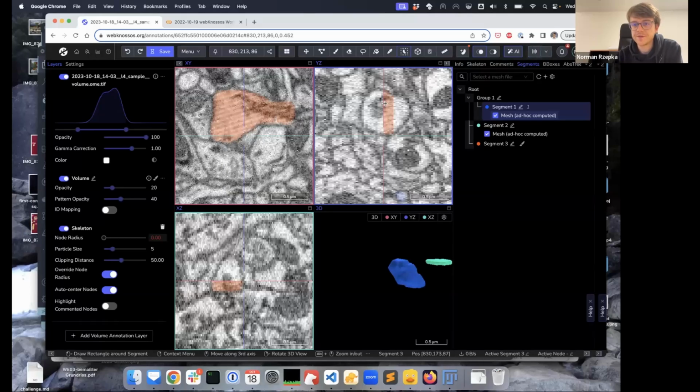And then, as I said, it also works well with the volume interpolation feature. So this is a very fast way of generating some volume annotations. It's not perfect all the time. That's why it's still useful to have the brushes around and to fine tune that. So this is the quick select tool. There it has the AI based mode. Also, we have a non-AI based mode.